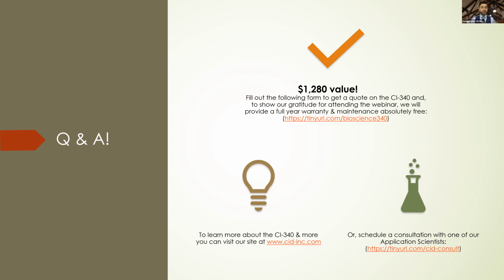The next question is, how long does it take to calibrate the unit? It takes about half an hour to do so, usually a lot less, but I'm thinking in the field, if you're trying to work with things that are a little bit unwieldy, about half an hour. If you're doing a less intensive one and have a lab setting, it would take like 15, 20 minutes.